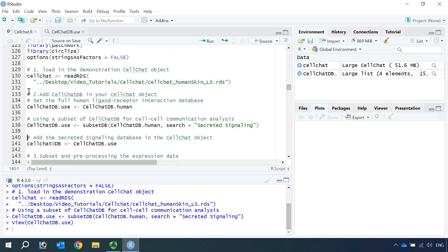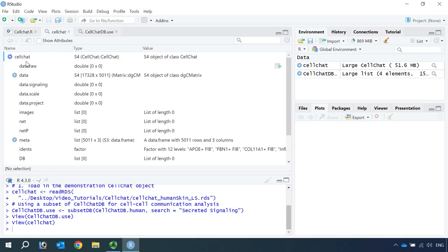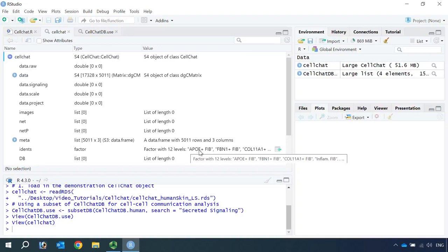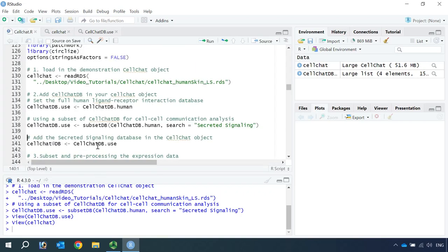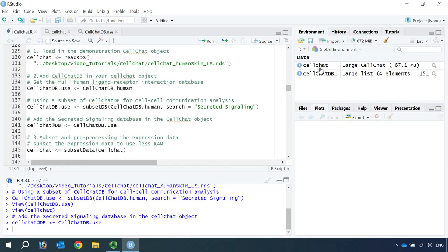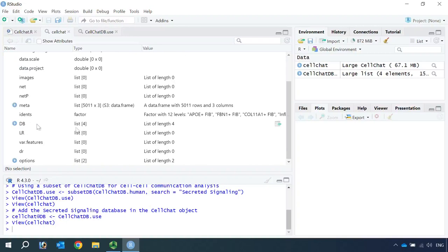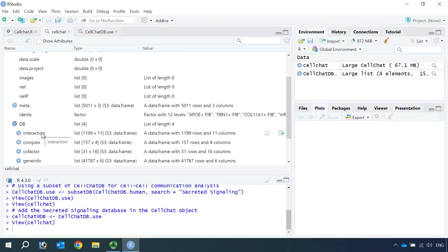So we loaded the data and set the CellChat database. Now we can add the secreted signaling database into the CellChat object. Before we do this, we can have a look at the CellChat object. At the moment, it only has the normalized matrix data and the metadata for cell type information. The database slot list is zero. Now we can add the CellChat database into the object and run this code. Now you can see we added the cell signaling database into the CellChat object.